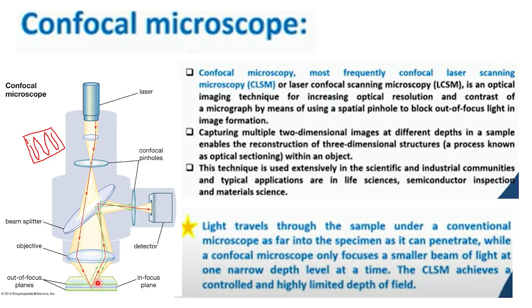For example, take data from the surface. After that, make a slice. So just put the initial surface slice apart and get the second slice data. For example, if there are three different slices, first you take the surface, then remove this slice, get the data from the second one, remove this second one, and get the data from the third one, through which you can construct a three-dimensional structure of your objects. That is the beauty of the confocal microscope.